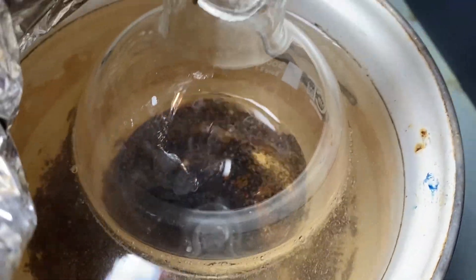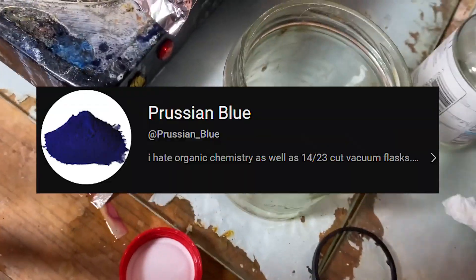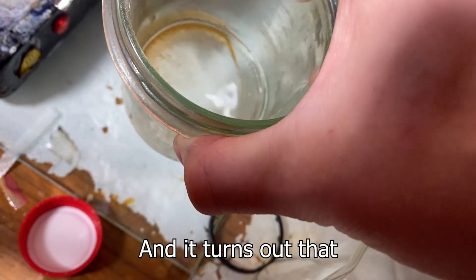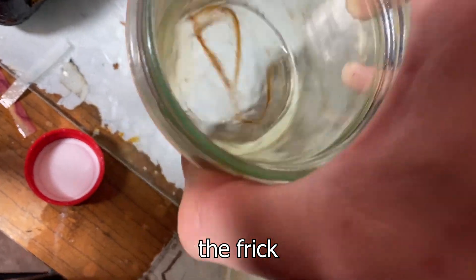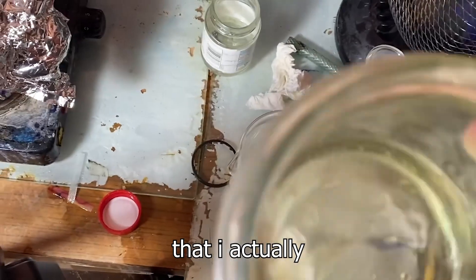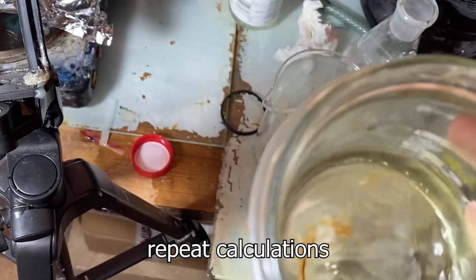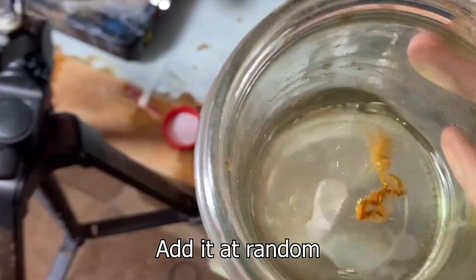I've just re-read the paper again and it turns out that I actually have to add sodium bromide to it. I really don't want to repeat calculations, so I'm just going to add it there at random.